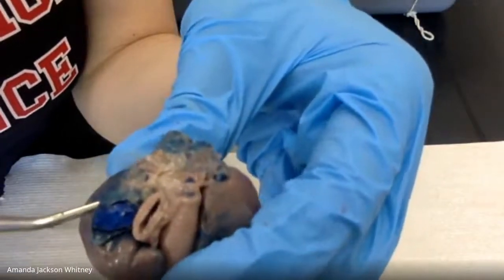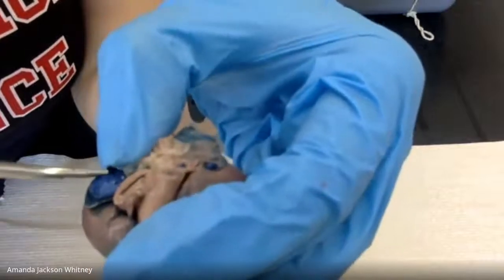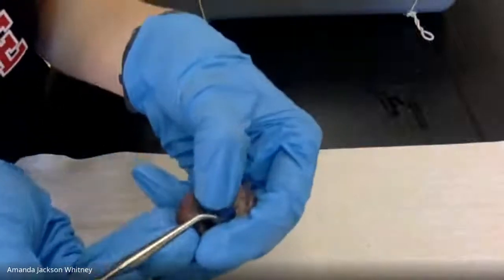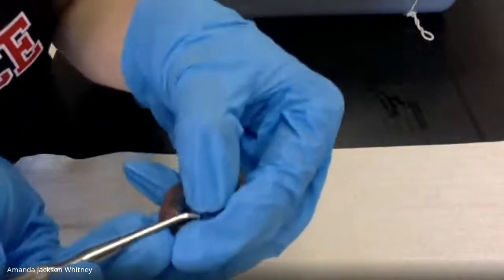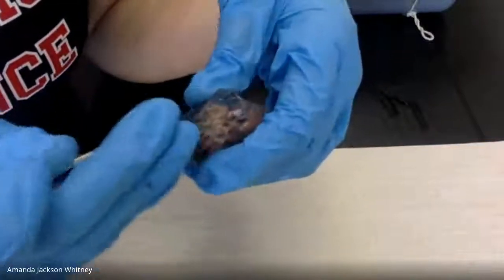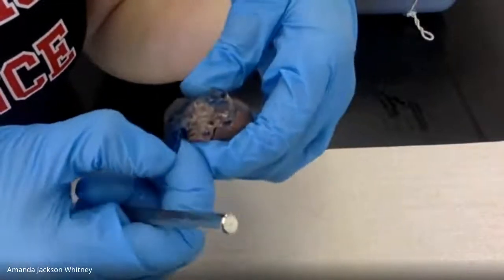This is so thin, and I know it's really hard to tell because of the latex in here, but it's so thin that I tried to take some of the latex out. I don't know if you guys can see that or not. And then I started to rip the walls of the vena cava because the walls are just so thin. Right?